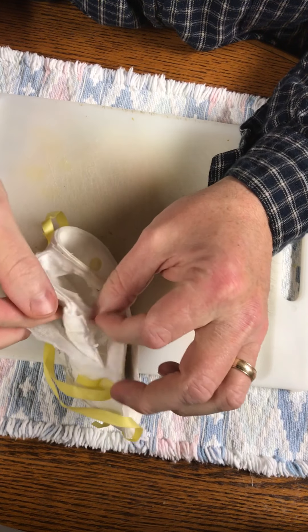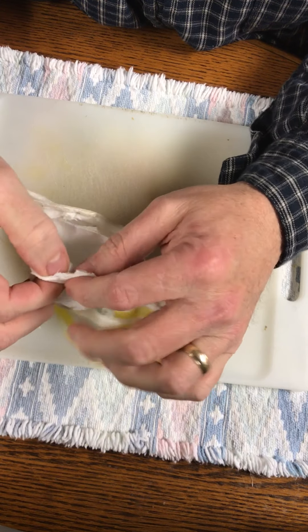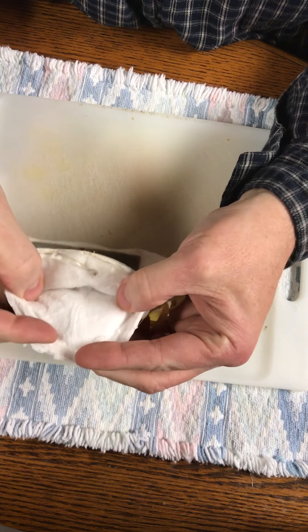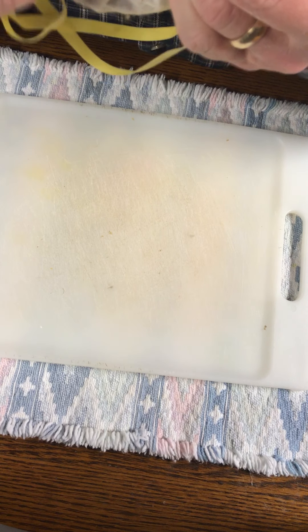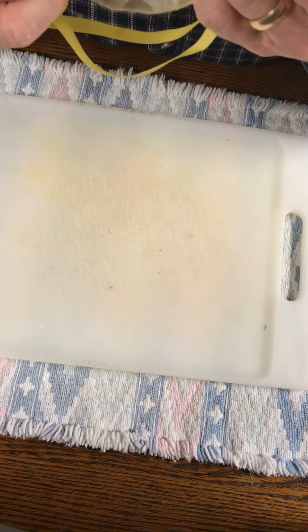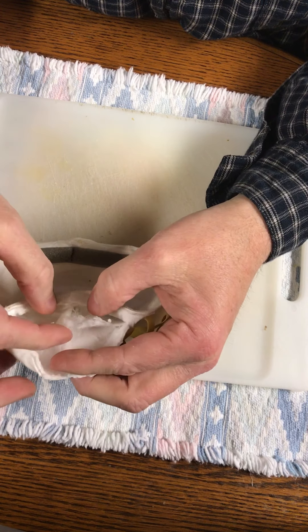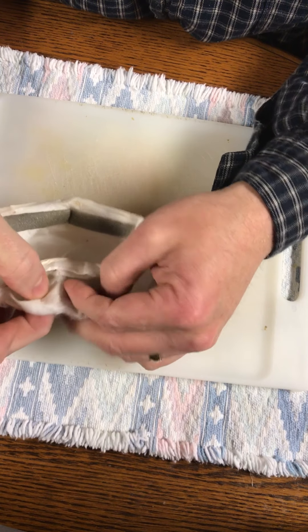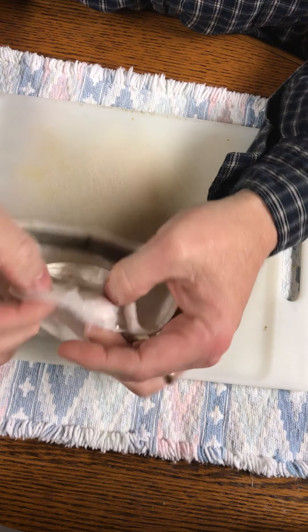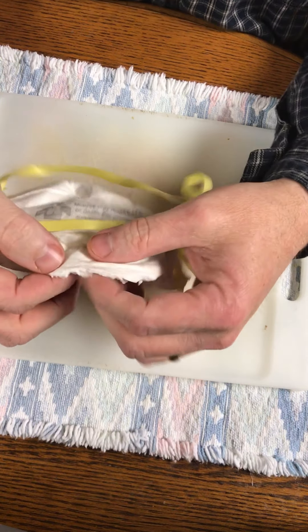This second material layer - which is this fiberglass-y, plasticky filter media - is really tough to blow through; you can't see through it. And the inside layer, when I blow through it, has hardly any resistance at all. So the meat of it is this middle layer.